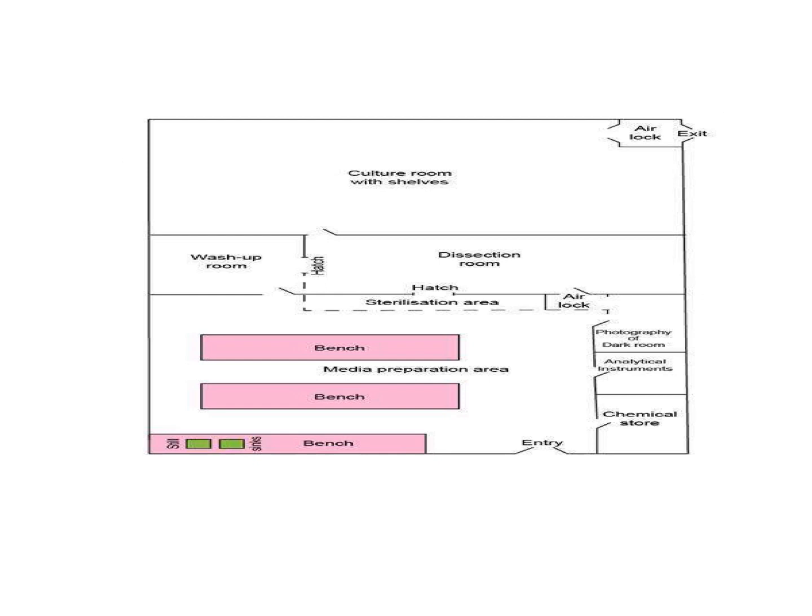And we should enter through the airlock, so that dust particles are cleaned from our body. We should have some airlock. And also we have to maintain a dissection room, because we should perform some anatomical or histochemical techniques after the tissue culture. And also, in the tissue culture racks and cells, we should have an inoculation chamber, and from the inoculation chamber we go to the culture rooms.